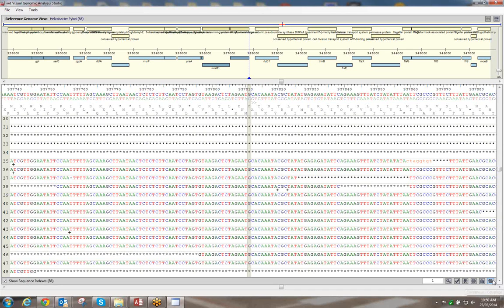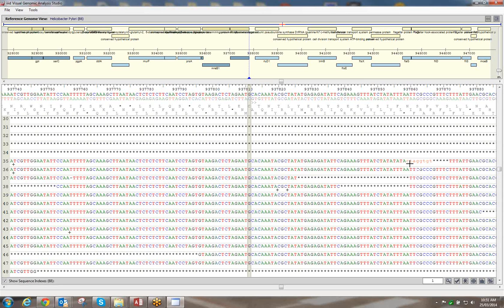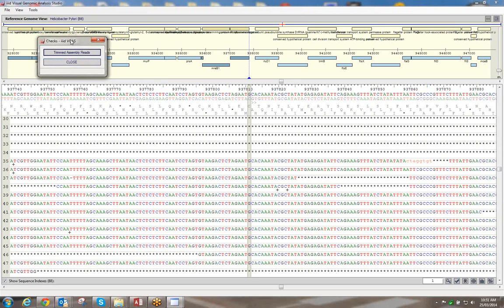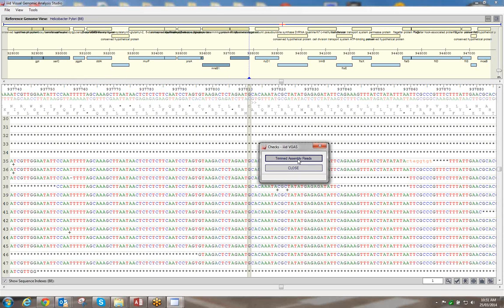If we do the consensus again, you also see lowercase letters in the sequence — these are the reads that have been trimmed off during alignment. They're not included in the analysis. The second icon — the tick — has a 'trimmed assembly read check', which goes through and gives you information about all the reads that have been trimmed and what the length of the trimmed read was.